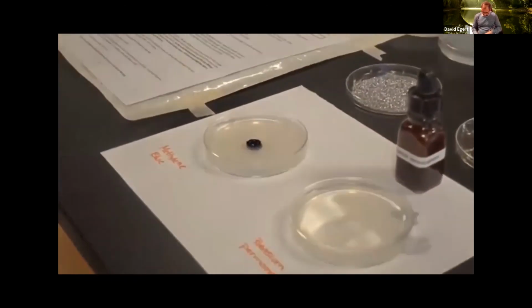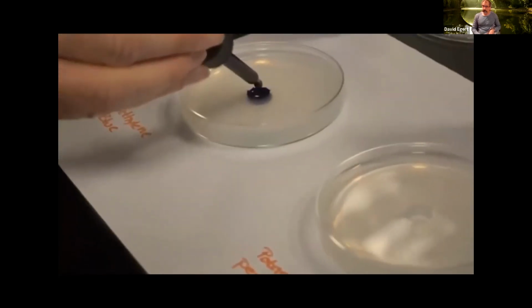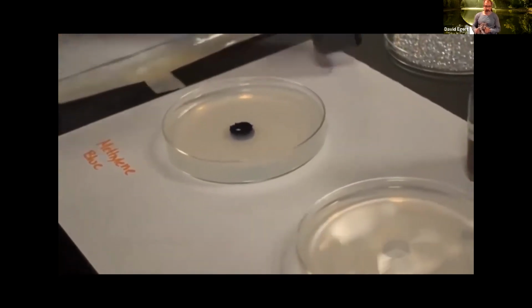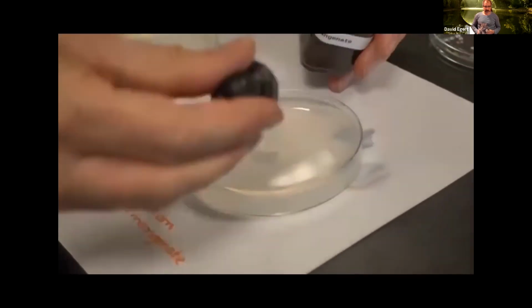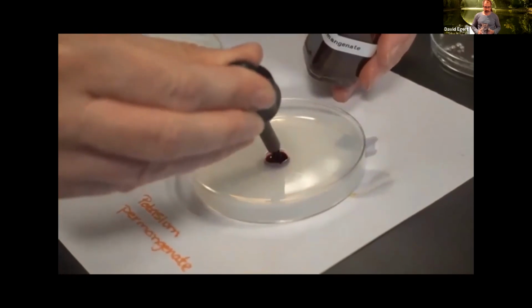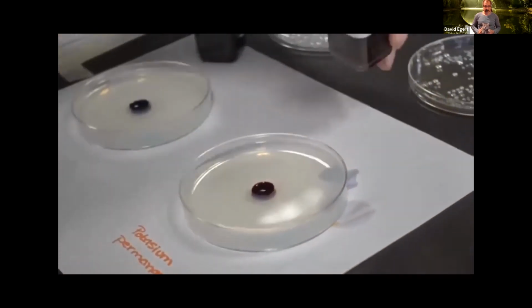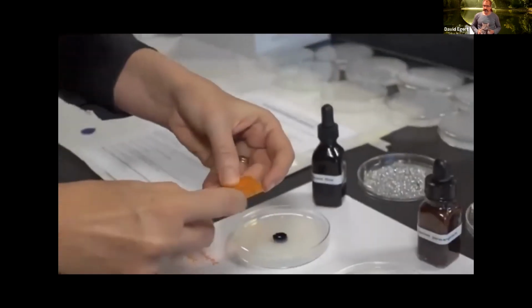Make sure, and you might have to come back and just make sure that it's topped off. So if it goes too low, you might want to add a few more drops. And we're also going to do our potassium permanganate. And when you measure after a half hour, of course, we're going to use the metric system.